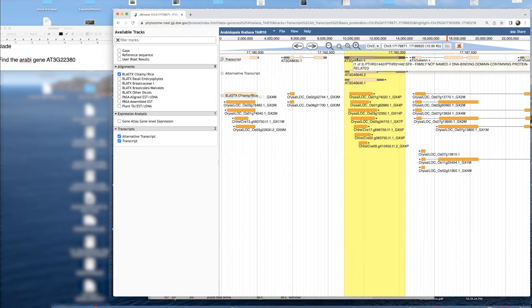You can see the 3 different transcripts. The orange indicates the coding sequence, and the gray is UTR. So you can guess by looking at this that the .1 and .2 alternative transcripts seem to have the same coding sequence. That's why the proteins are the same, whereas the primary has this additional downstream bit of coding sequence on the terminal exon.